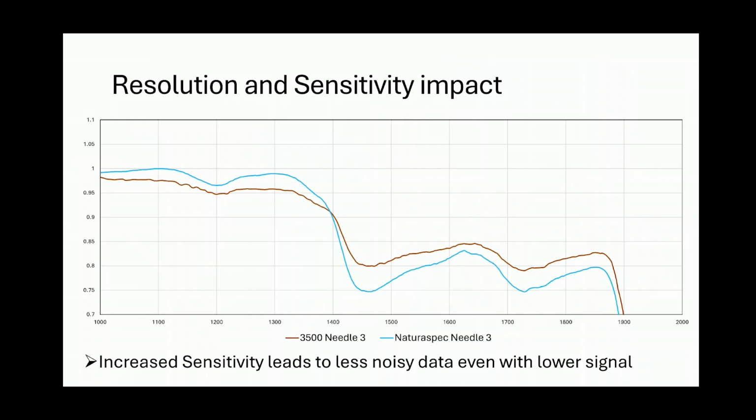Noise can be a big factor when identifying different absorption features, so it's critical to have the best sensitivity in your measurements.